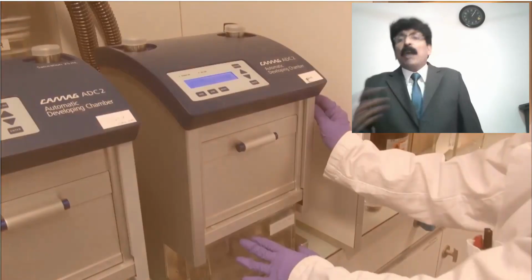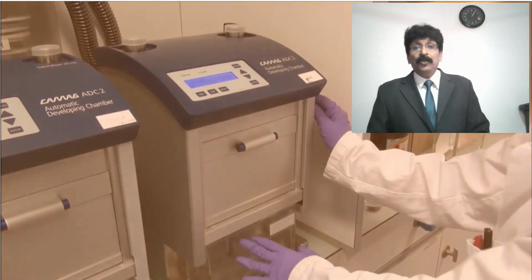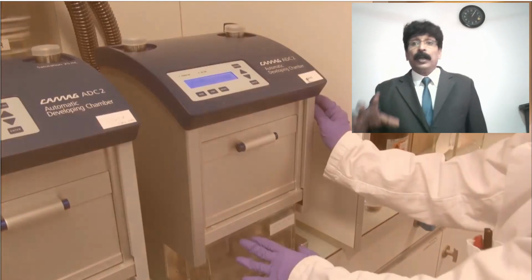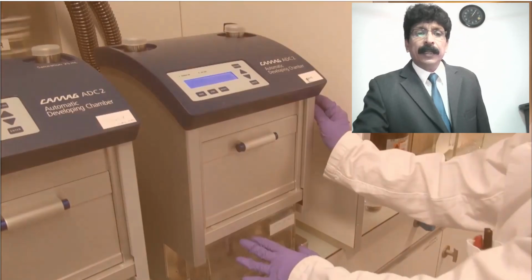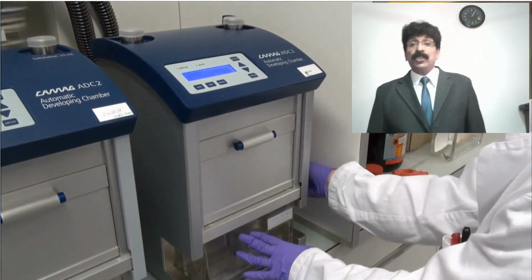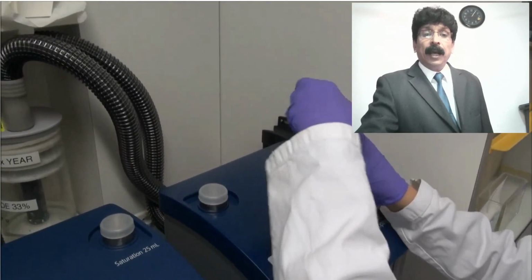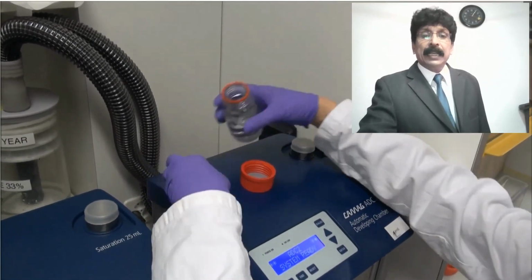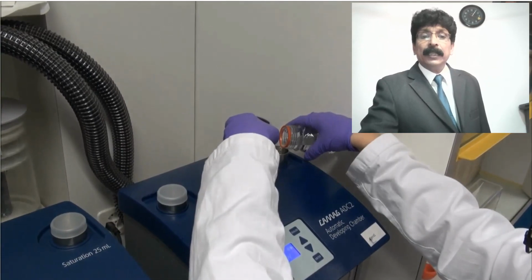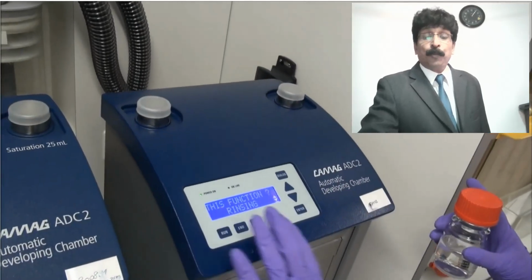And after sampling, the next step is rinsing before developing. How are you going to rinse? You have to rinse and clean using a solvent system. At the same time, the developing chamber should be rinsed with methanol, cleaning, saturation, and preconditioning are also needed.